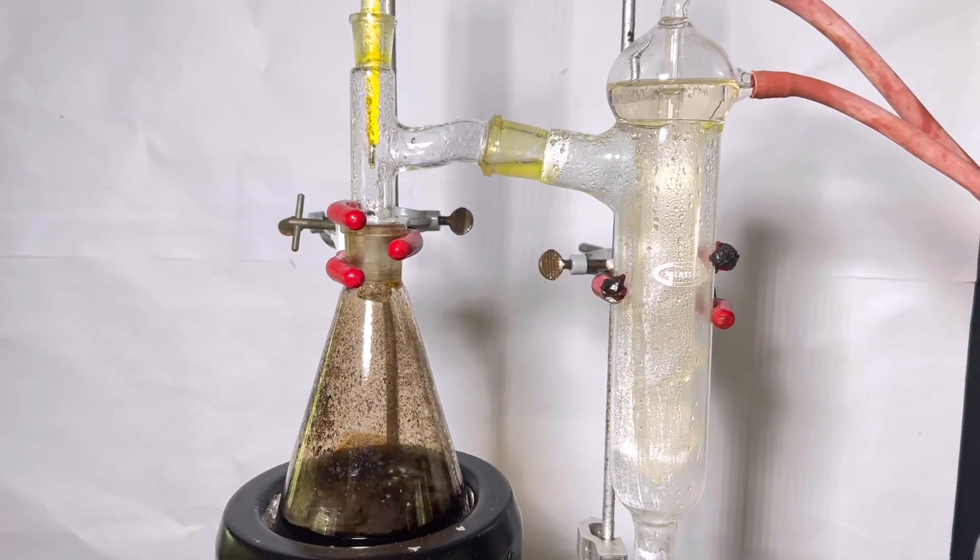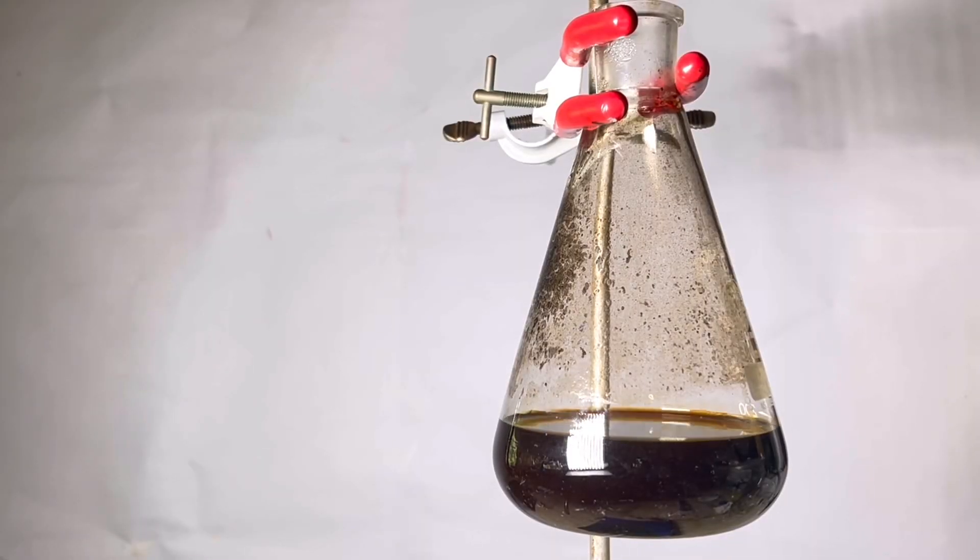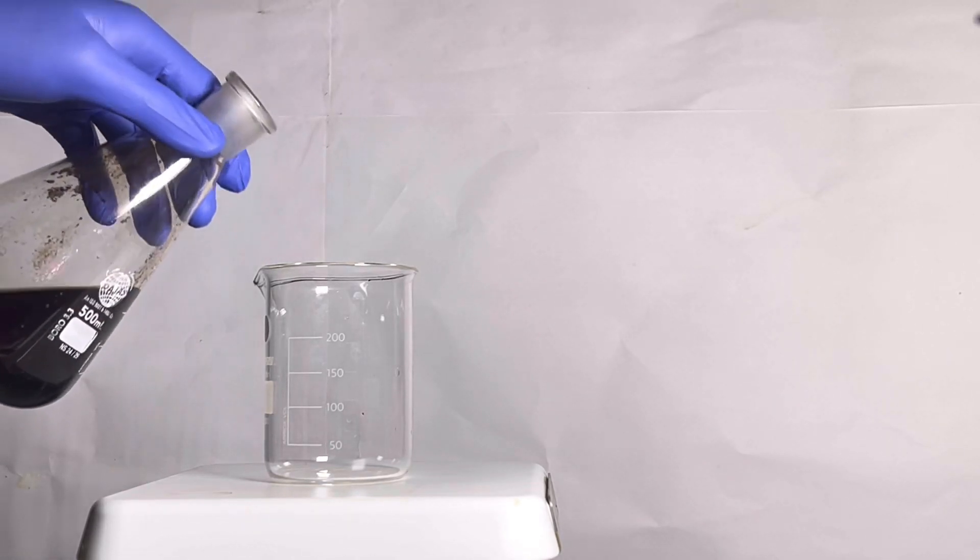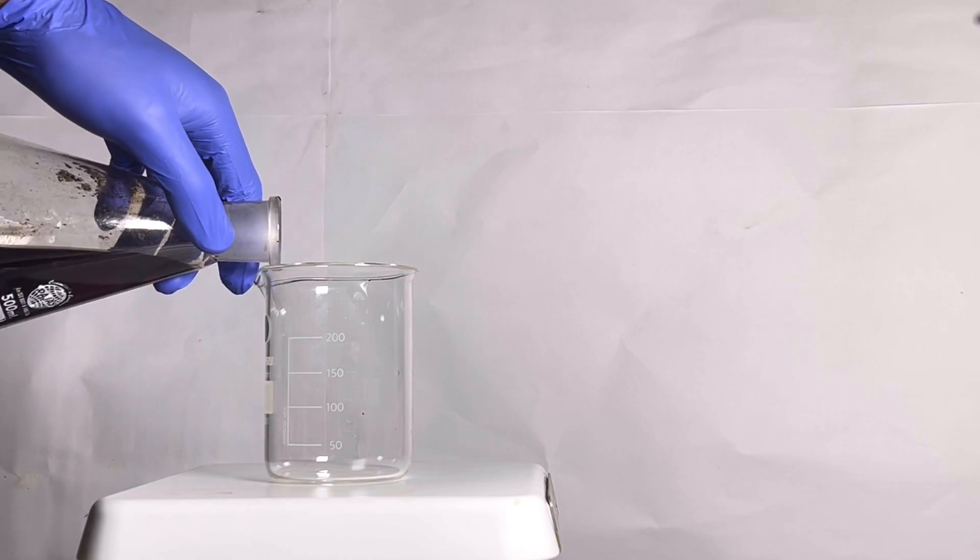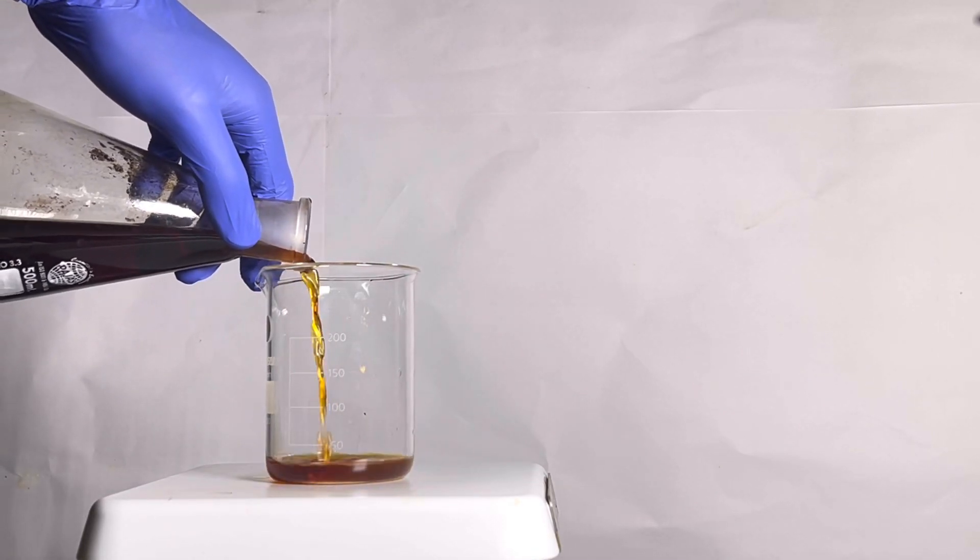The receiving flask containing ortho-nitrophenol is kept in the refrigerator overnight. The distilling flask was let to stand for few minutes. The maximum possible liquid from the top is decanted into a beaker. This contains para-nitrophenol. This beaker is also placed into the refrigerator.